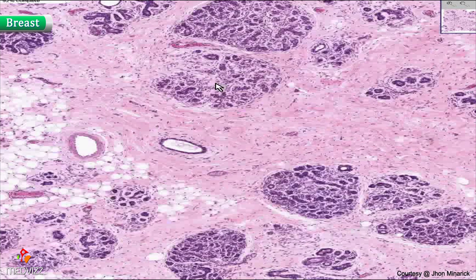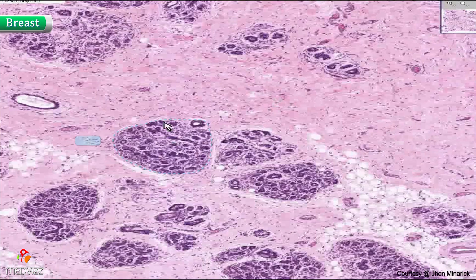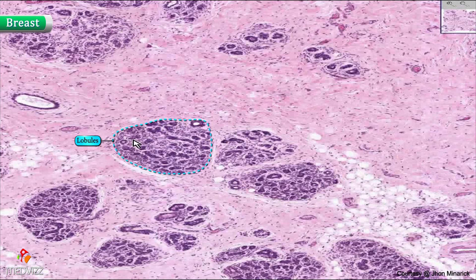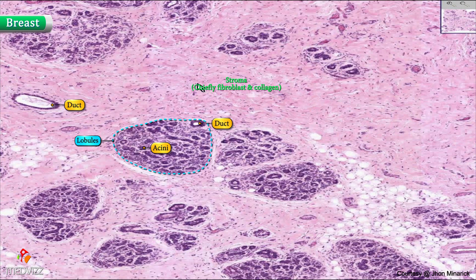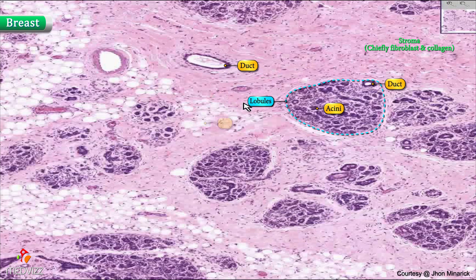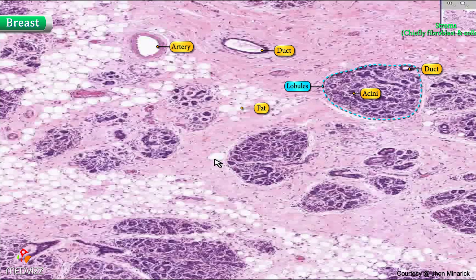This is shotgun histology. You can identify lobules, small acini, ducts, bigger ducts, connective tissue called stroma — chiefly fibroblasts and collagen — fat, large arteries, veins, or perhaps lymphatics.